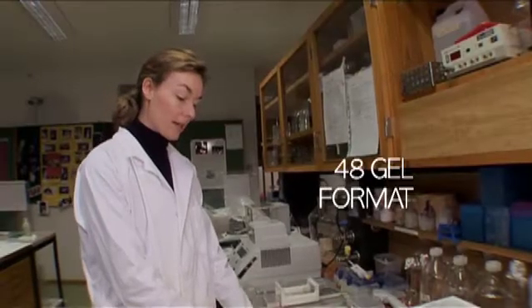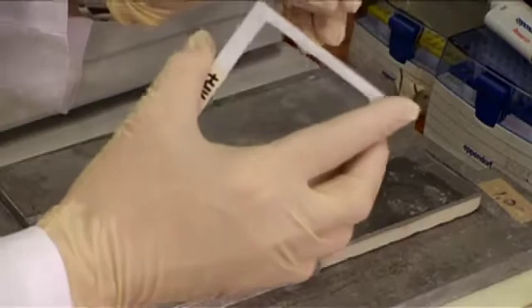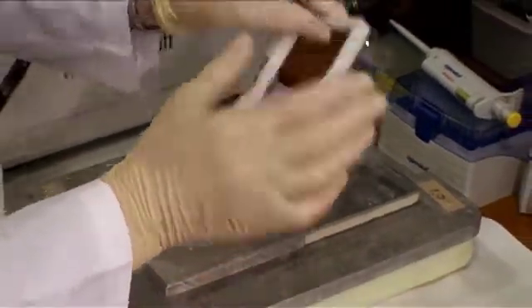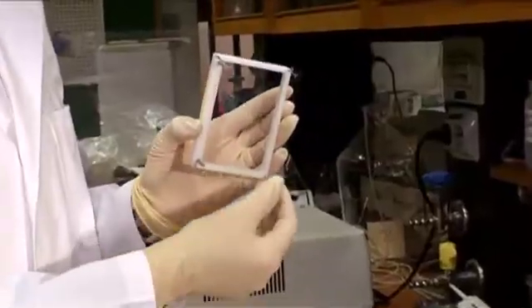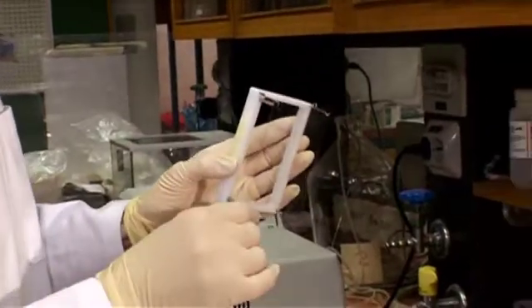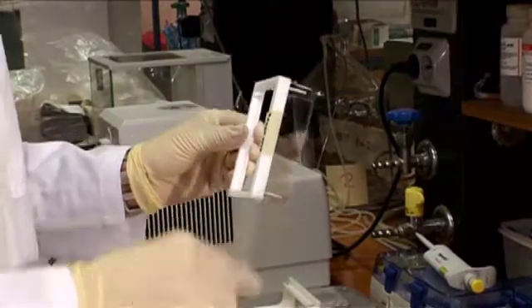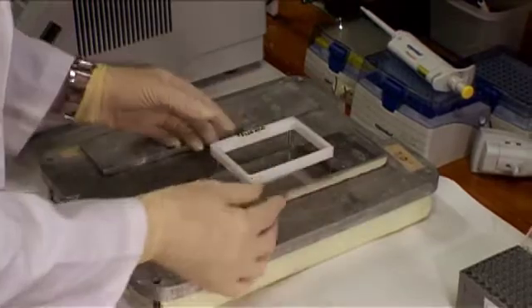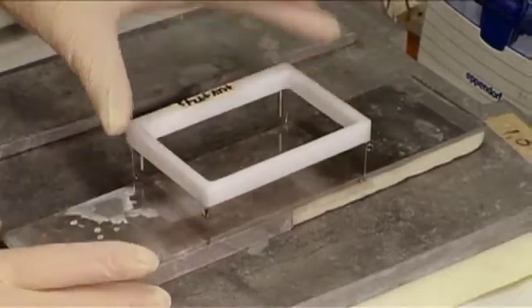Now we're going to demonstrate molding of a multi-gel bond film. So I start by hooking on the gel bond film to the plastic support frame, and they have holes in every corner, so it's easy to hook it on to this frame. And it has also a corner which is cut in order to orient the gel bond correctly. And then I place it onto a cold plate, so the gel bond lies flat on the surface.